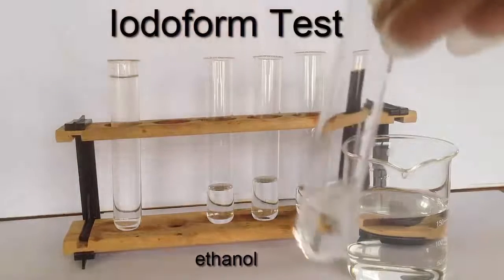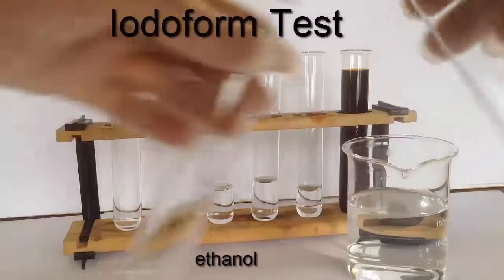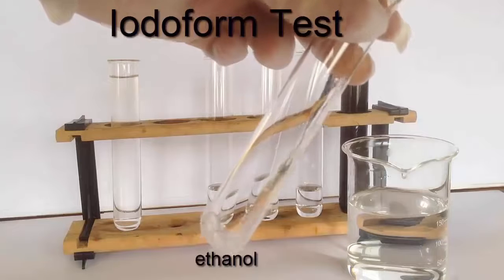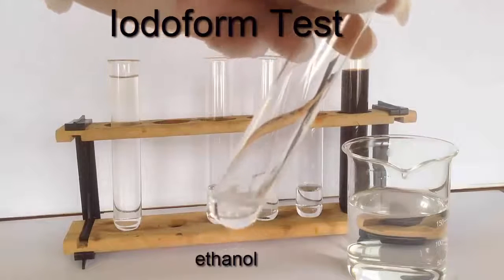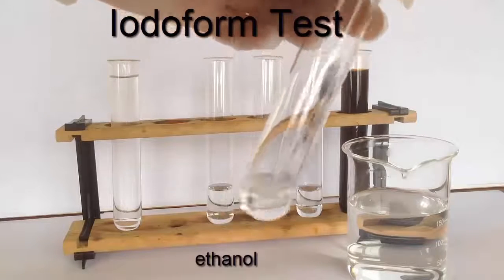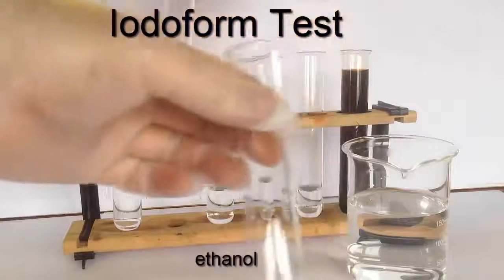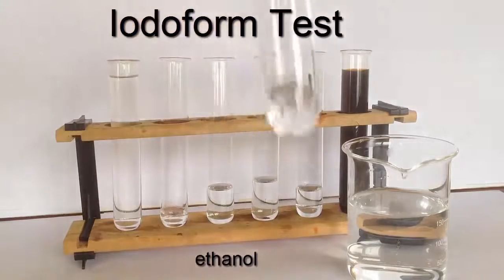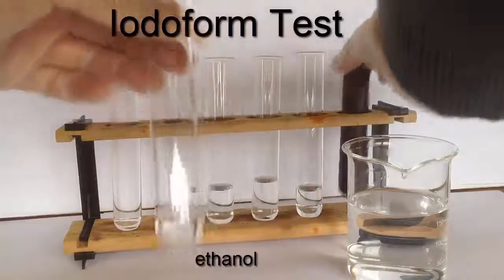negative. So I'm going to begin with the ethanol, as you can see, and I'll take some in a second boiling tube. Normally we just take 1 or 2 cubic centimeters of the alcohol in a test tube, but for the purpose of this demonstration video I've taken a much larger volume.